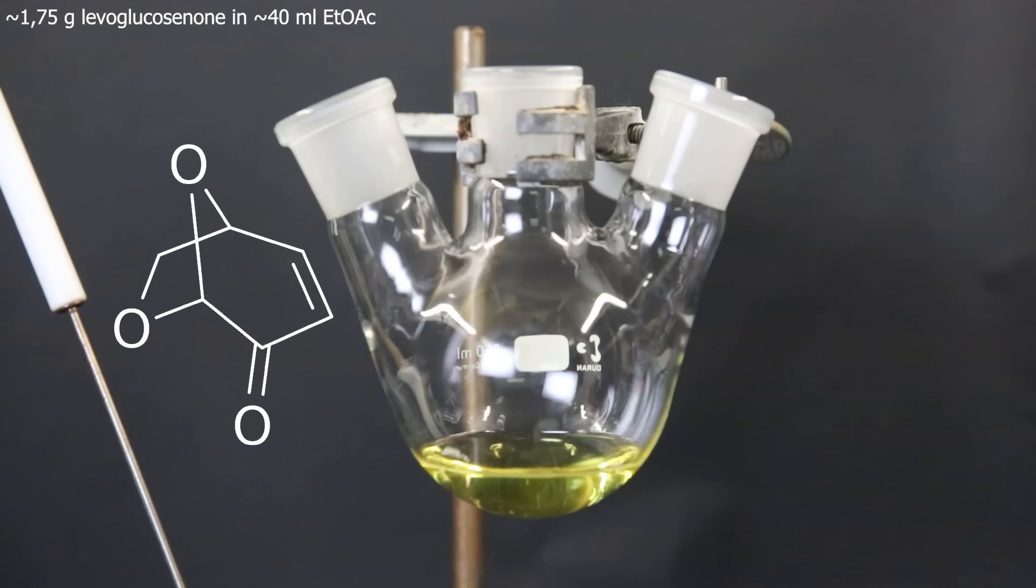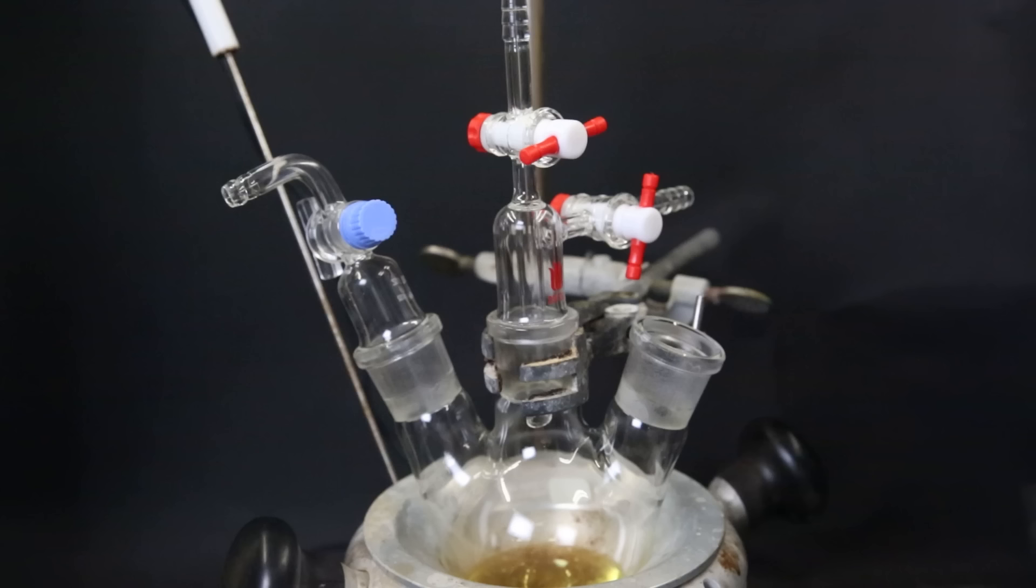Now I have to perform a selective hydrogenation to only hydrogenate the double bonds and not touch the ketone. The solvent for this hydrogenation is ethyl acetate, which is already in here. So I move the flask to a heating mantle and attach the gas adapter, a two-way gas adapter and a funnel.